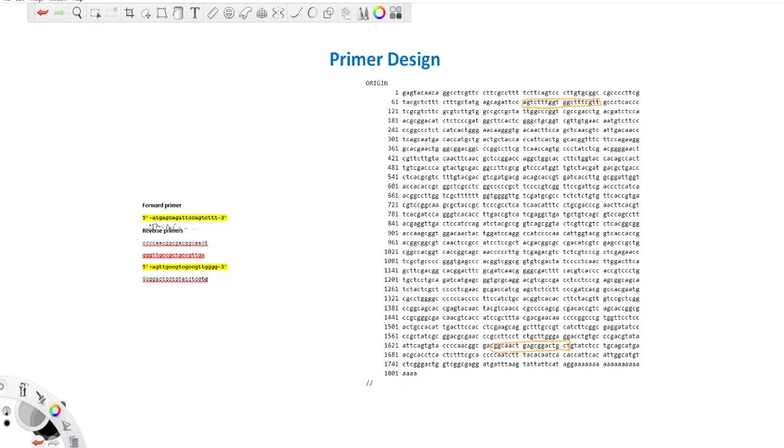You get the picture. So my actual primer is going to be this one. This is just this region here that I brought here. I hope that makes sense to you. All you have to do is take the complementary of this region, and that is going to be your actual primer. It's very straightforward. It's going to move in this direction.